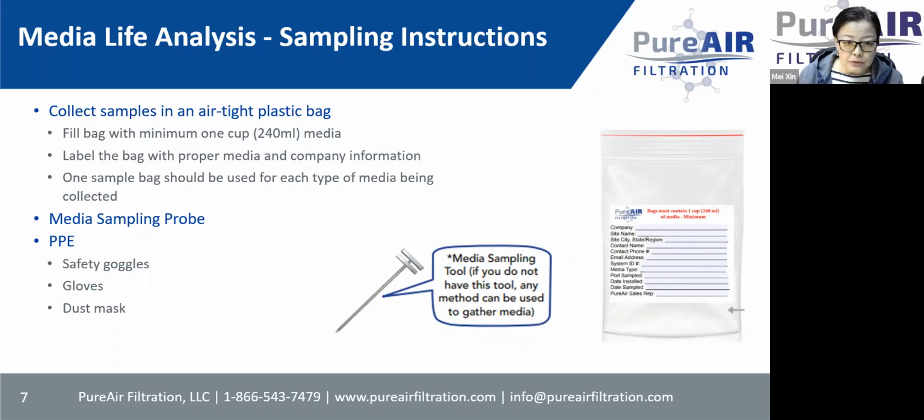So another tool you need is a media sampling probe. So it shows in the picture to the right, lower right. And you need this tool to extract sample from your system. If you have something similar, I know there are other tools available. This one can be used to gather media as well.